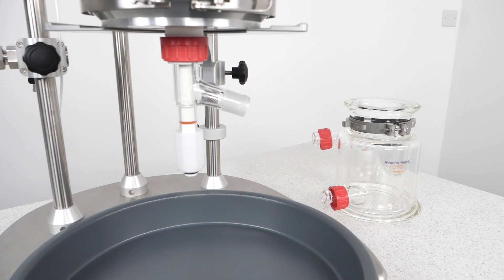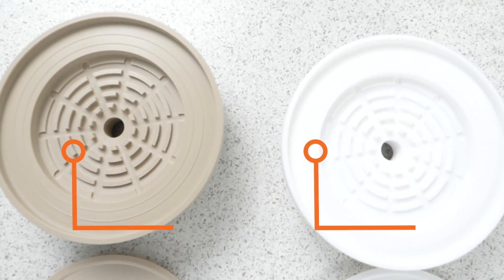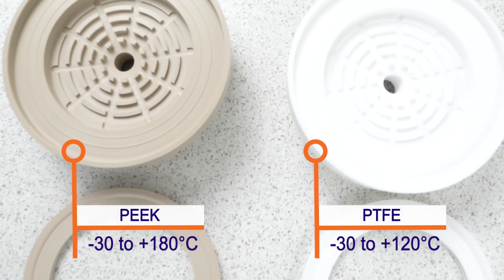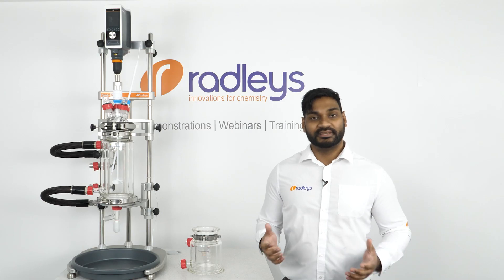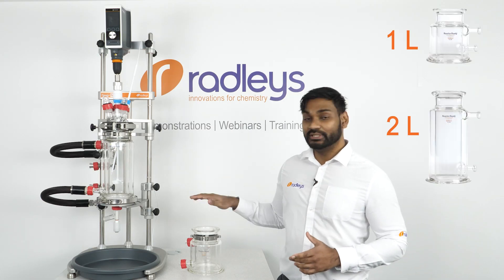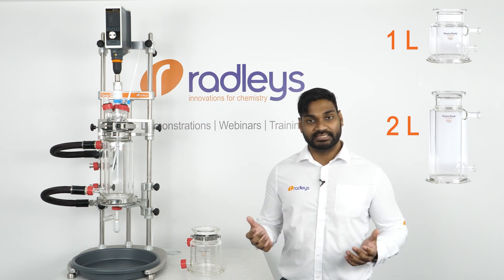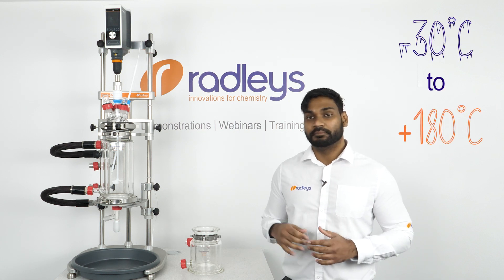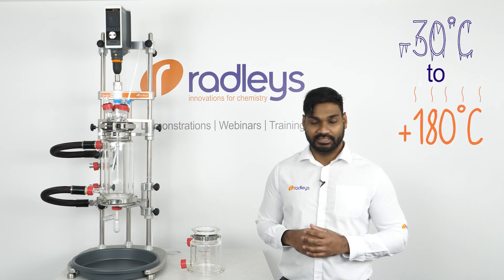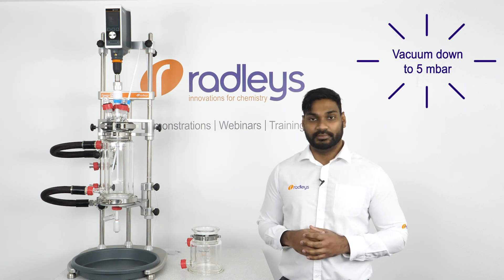Our filter vessels are jacketed glass reaction vessels which have a removable filter plate made of PTFE or PEEK. You can choose between them depending on what solvent and temperature you're using. Our filter vessels come in 1 litre and 2 litre volumes and are fully jacketed for connection to a circulator, giving excellent temperature control from minus 30 to plus 180 degrees Celsius. Filtrations can be done by gravity or under vacuum down to 5 millibar.